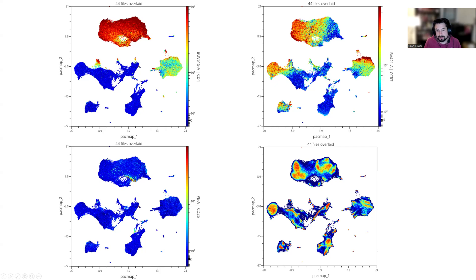And here, this is something I like to put up when I'm looking at dimensionality reduction results, is a density dot plot. So people who are looking at these can see where there are many events stacked in this representation versus relatively few.